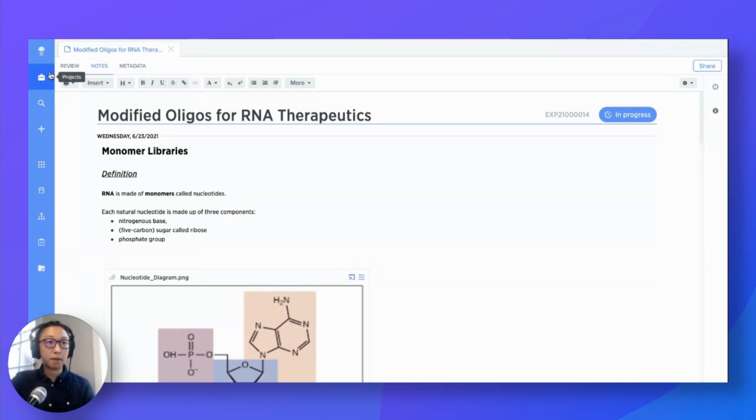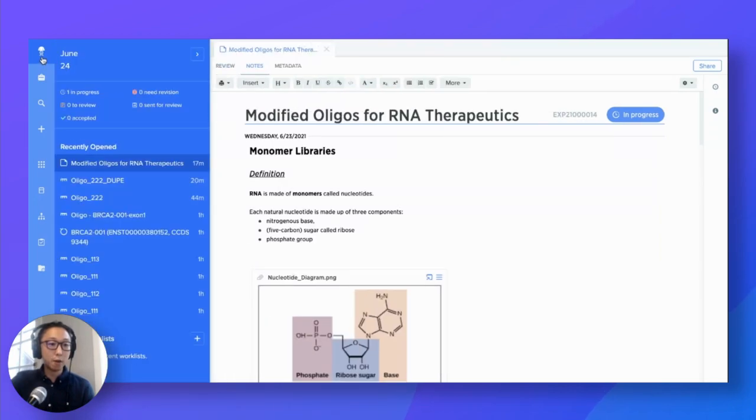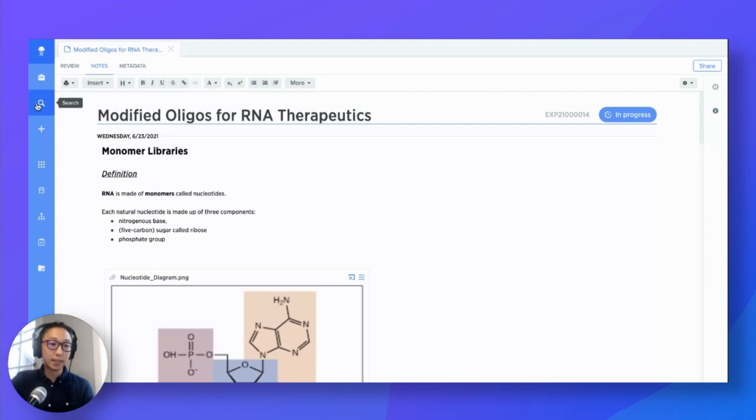So just really quickly for folks who are new to the Benchling platform, this is the Benchling web application. Benchling's a cloud-based platform. I've signed in here, and immediately on the left-hand side, you can see the Benchling home page, projects, search tool, as well as all of the other applications that you might be able to bundle into Benchling, such as our registry, inventory, workflows, and requests tool.